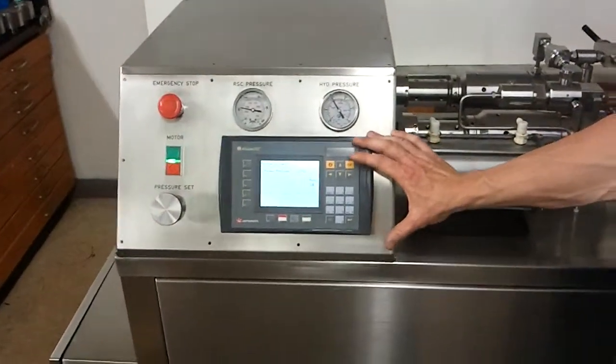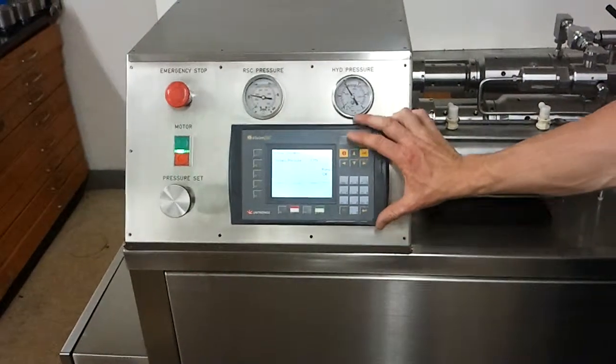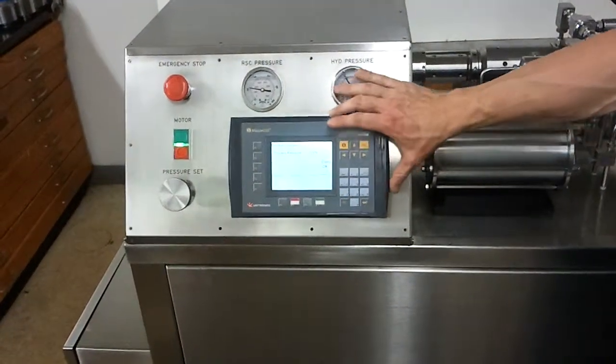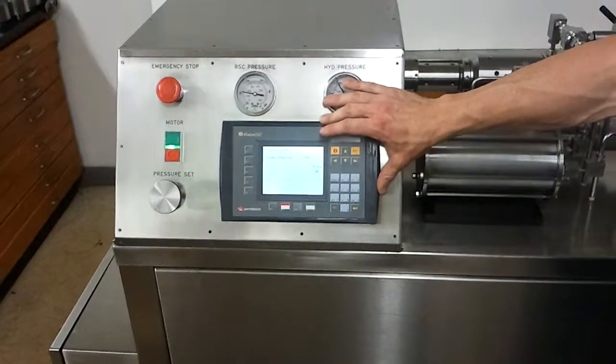Over here we have the PLC which gives the operator process pressure, temperature, and other parameters.